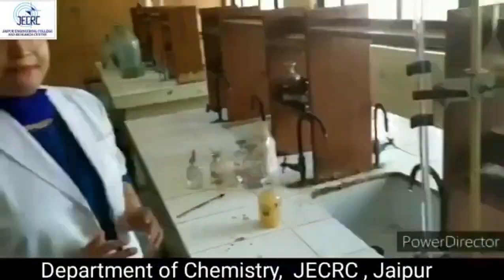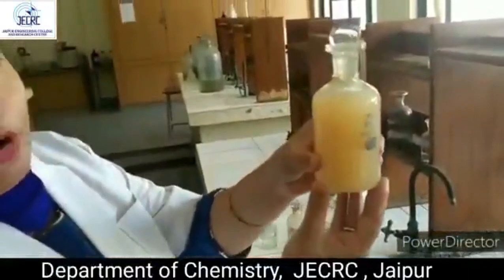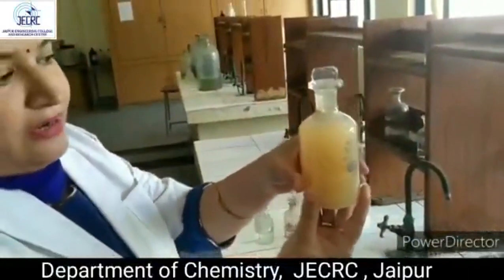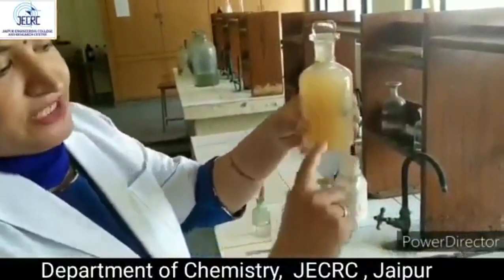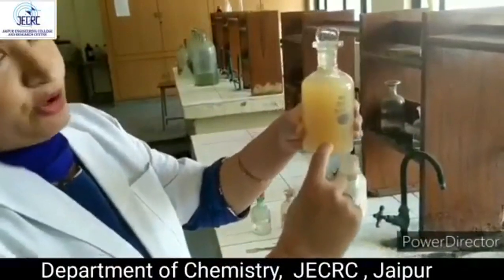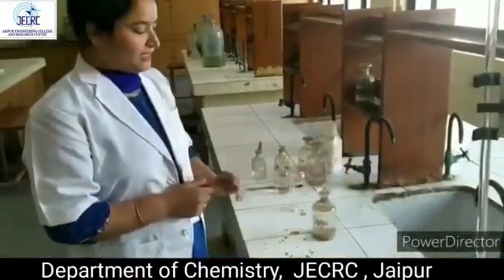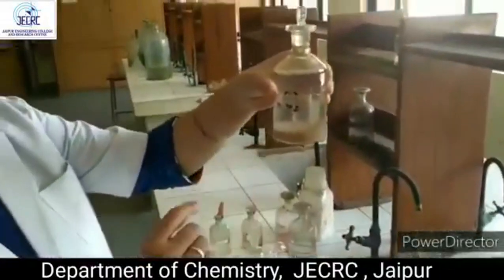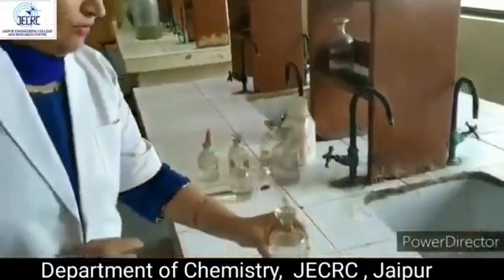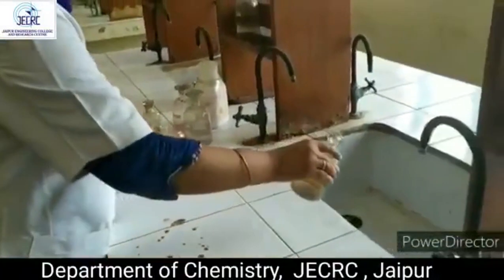So after some time, the precipitate starts forming. These are the brown precipitates that are formed, and after 15 to 20 minutes, these precipitates will settle down at the bottom. After 15 minutes, the precipitates have formed and settled down at the bottom. Now, we'll remove the water from the top.